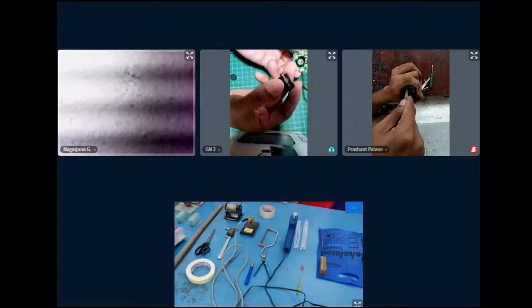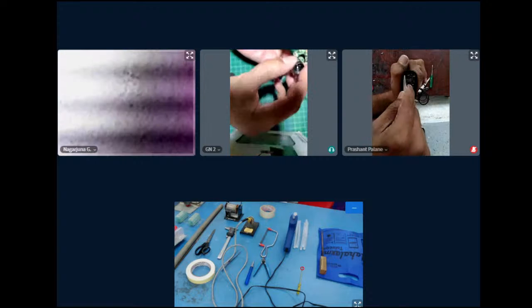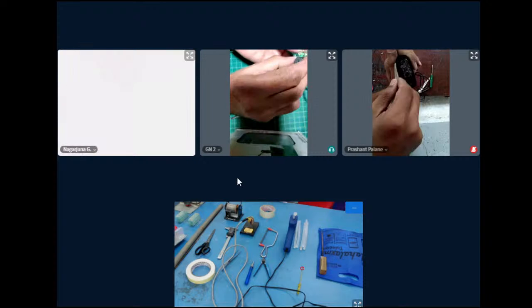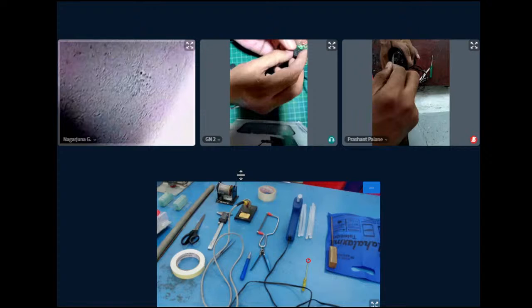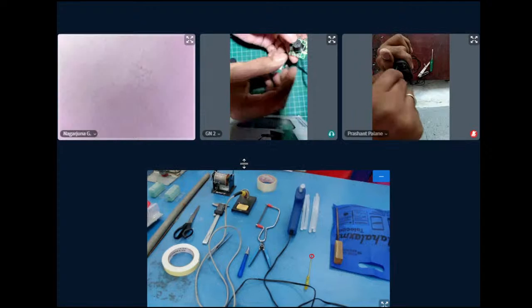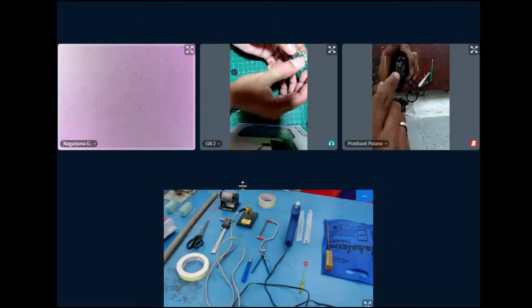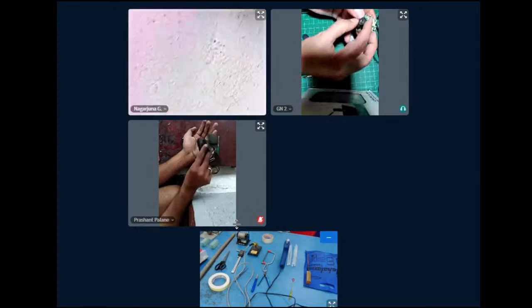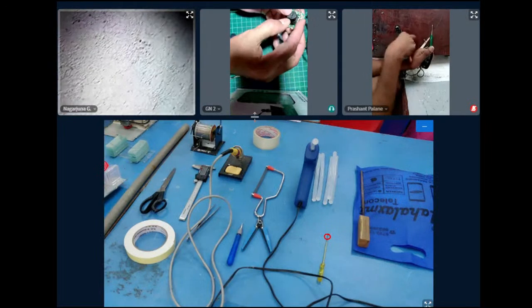So now what I want to do is take this one inside, like this. So you're basically inverting it. Yeah. When I do that, the focus is going to become very less. That means the range where you will be able to focus will become very, very small.